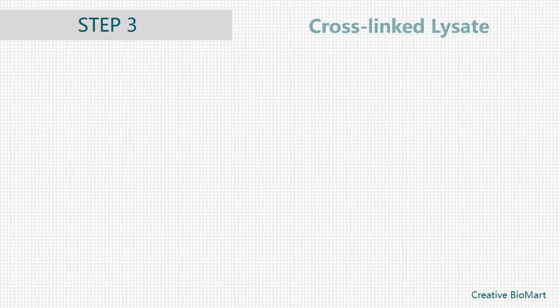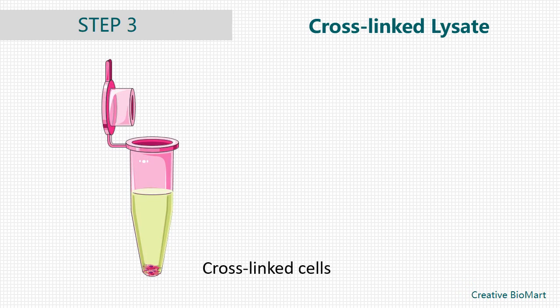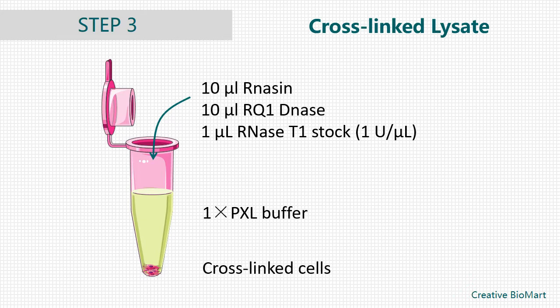Step 3, Cross-linked Lysate Workup. Lyse cross-linked cells using PXL, and sit the lysates on ice for 10 minutes. Add 10 µL RNasin and 10 µL RQ1 DNase to each tube. Incubate at 37°C for 15 minutes. Add 1 µL RNase T1 stock to the solution. Incubate at 37°C for 10 minutes shaking at 1,000 RPM. Next, spin the lysates in a pre-chilled micro-ultracentrifuge at 90K for 25 minutes at 4°C.